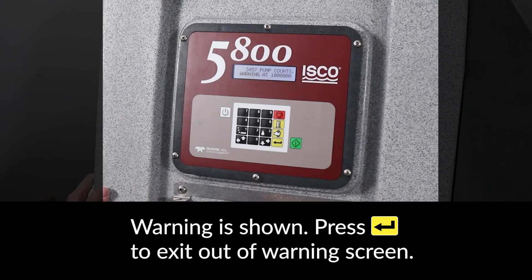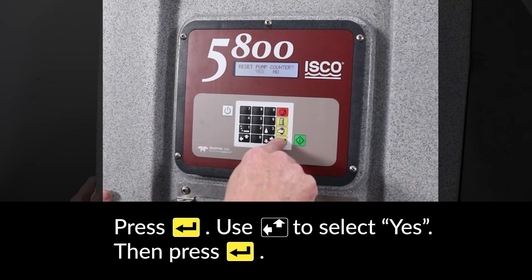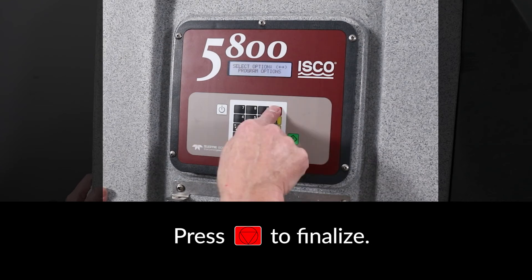The tubing life warning setting will be shown. Press ENTER to exit out of the warning screen. Press ENTER again. Then press the arrow key to select YES and press ENTER. Press ENTER again to reset the pump counter.